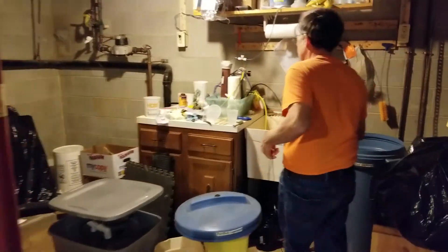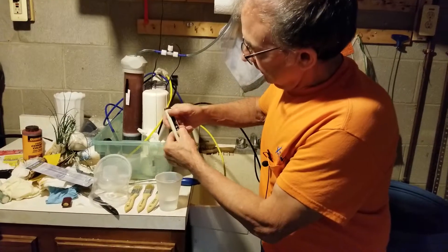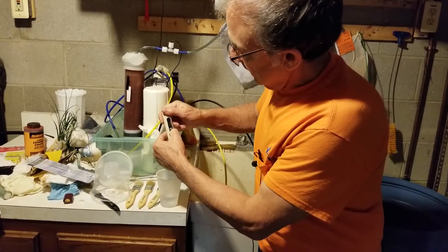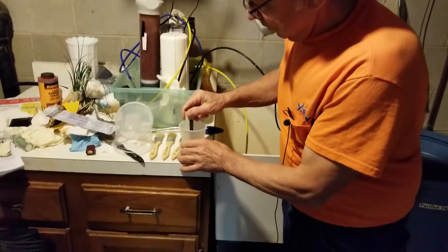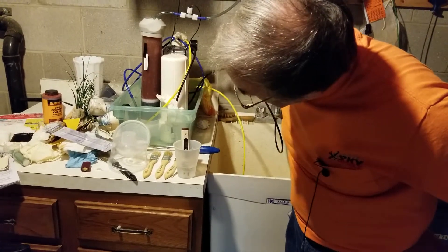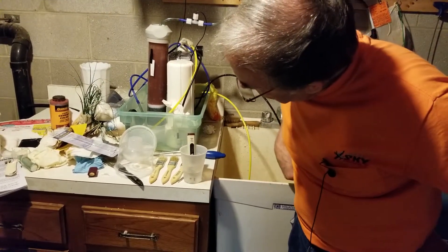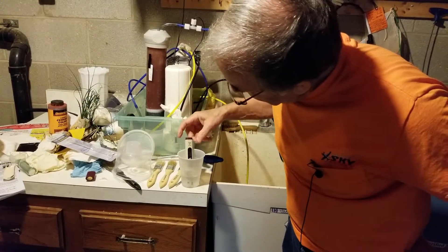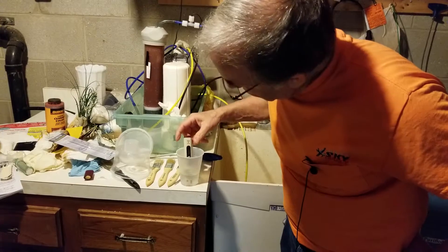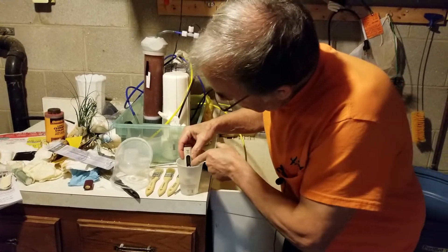One last thing — the temperature feature. If you needed a quick reading of the temperature of your water or aquarium, you can switch it to temperature mode. I'll turn it off, turn it back on, press temperature, put it in the water, and stir it up. It's stabilizing around a little over 17 degrees centigrade — 17.2, now 17.3. If I press temp again, it will switch to 63.2 degrees Fahrenheit.